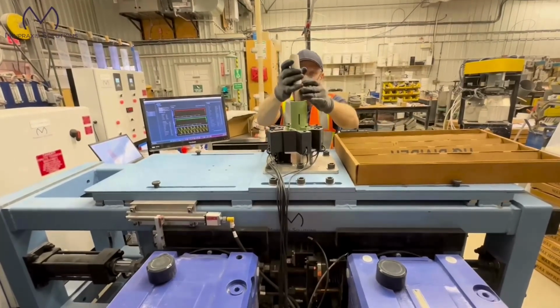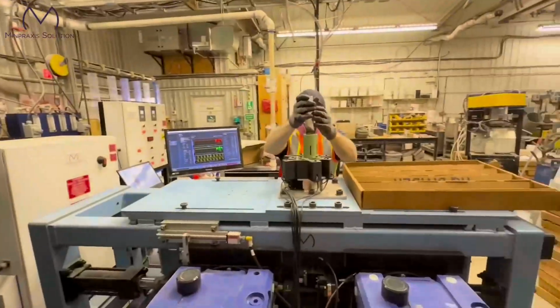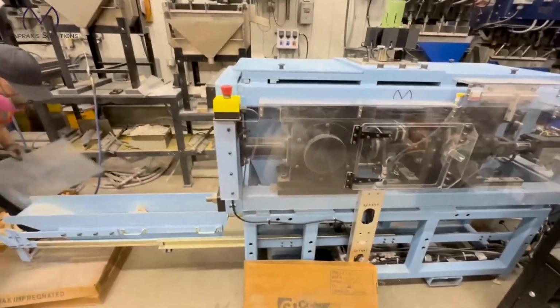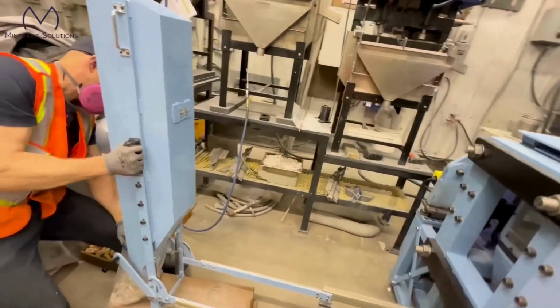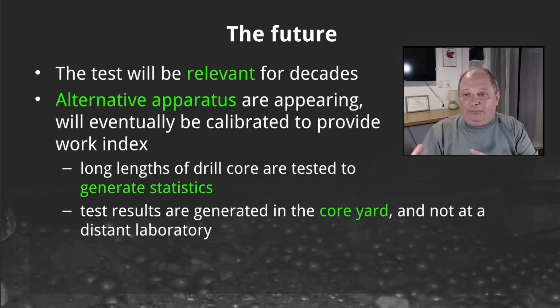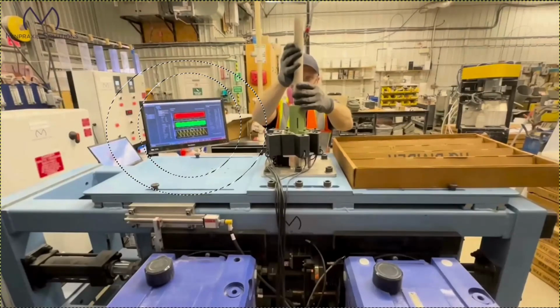This is the MinPraxis tester that generates statistics for geotechnical information and can estimate drop weight indices as it's doing the size reduction of core to make an assay sample. At the end of this test, they've got a bag of material that then goes out to the assay lab. So this is a crusher that makes lab samples, but it also pulls out geotechnical information.